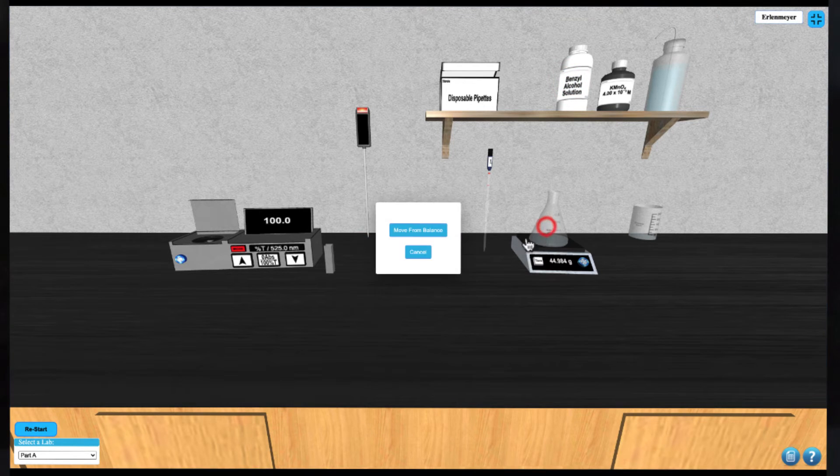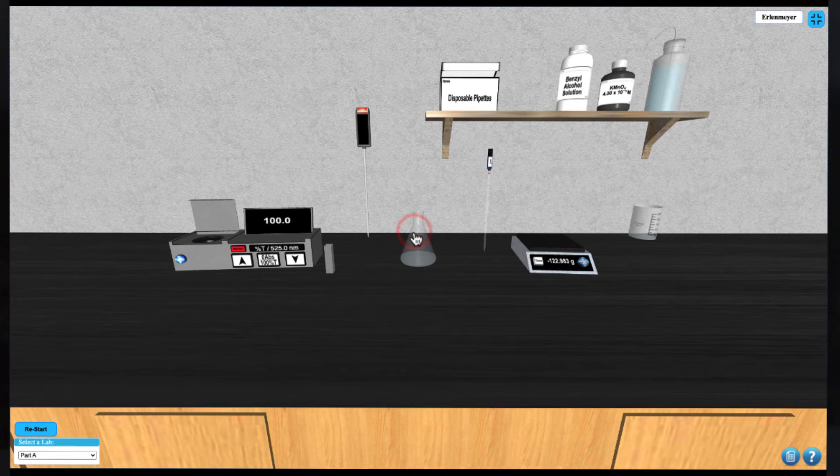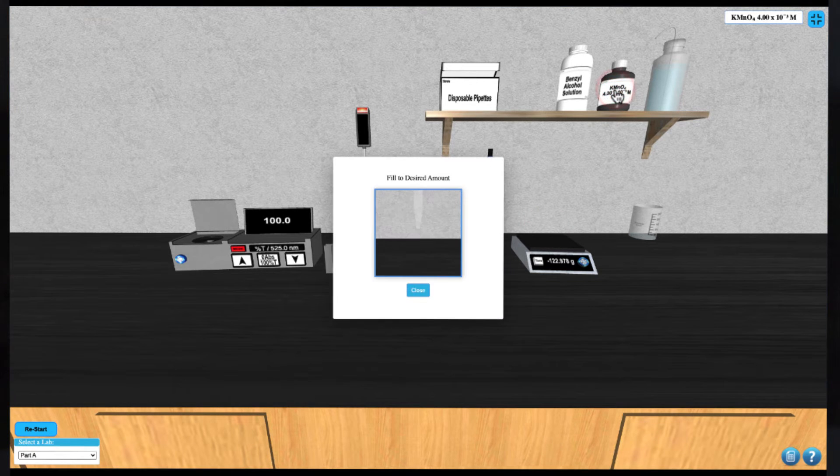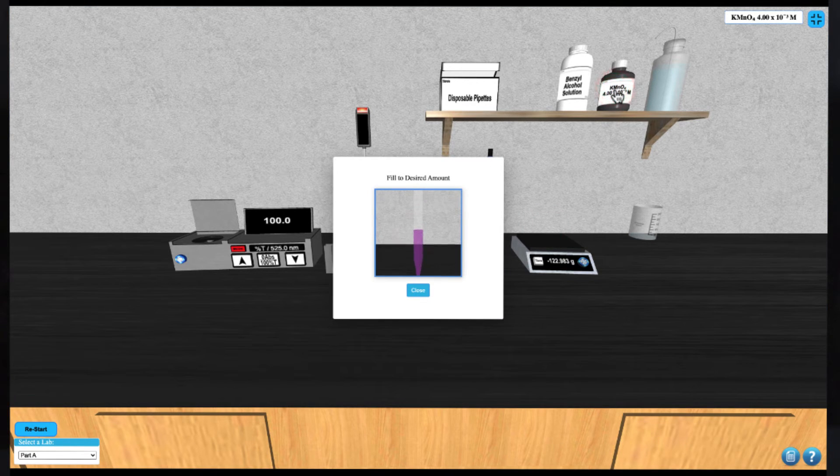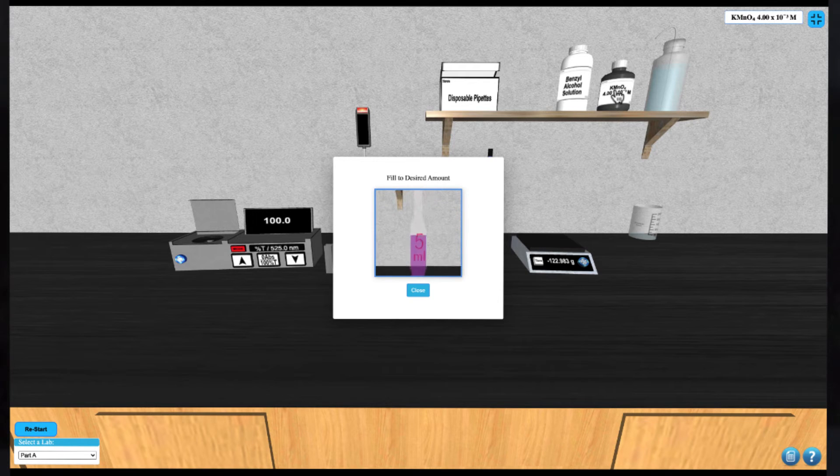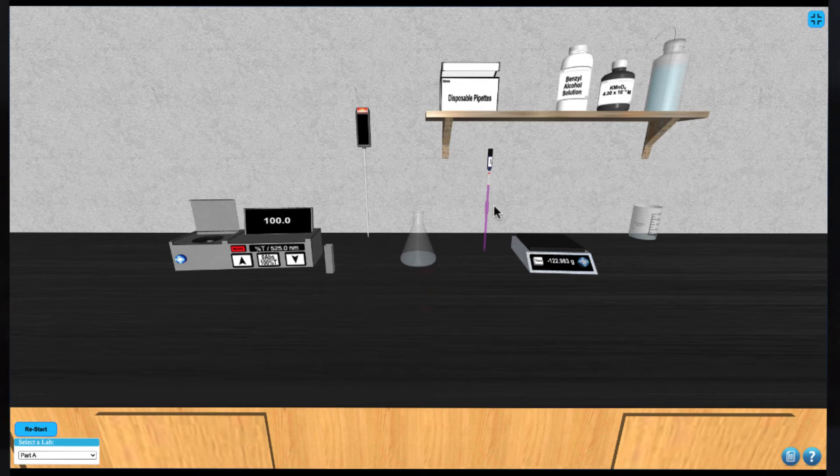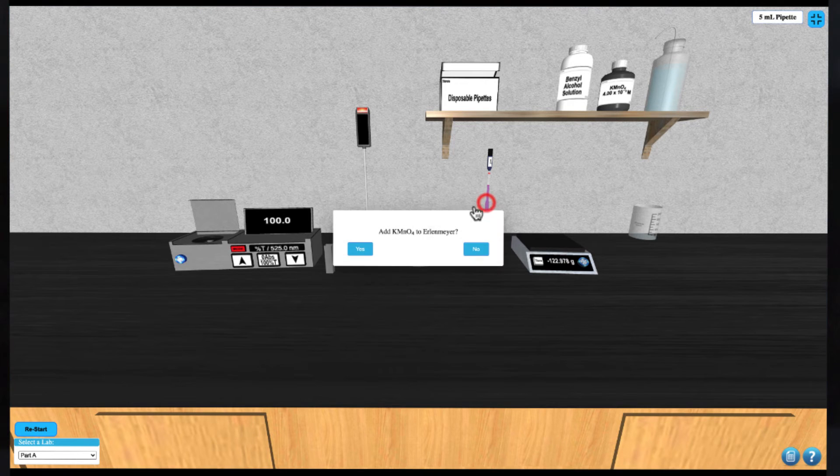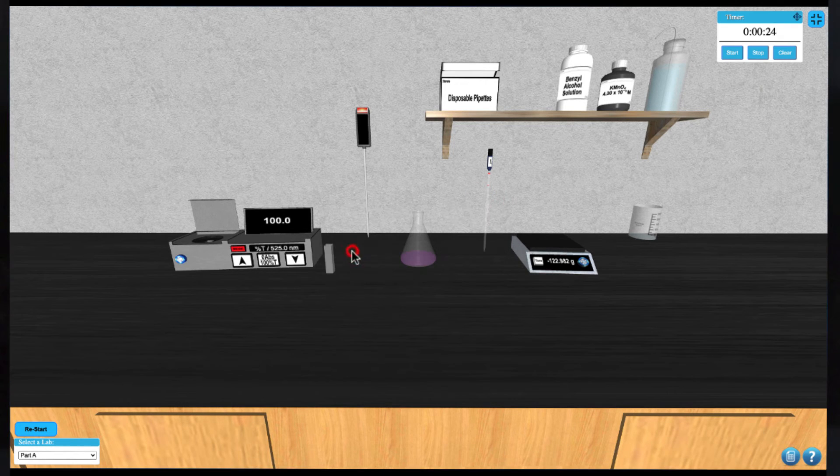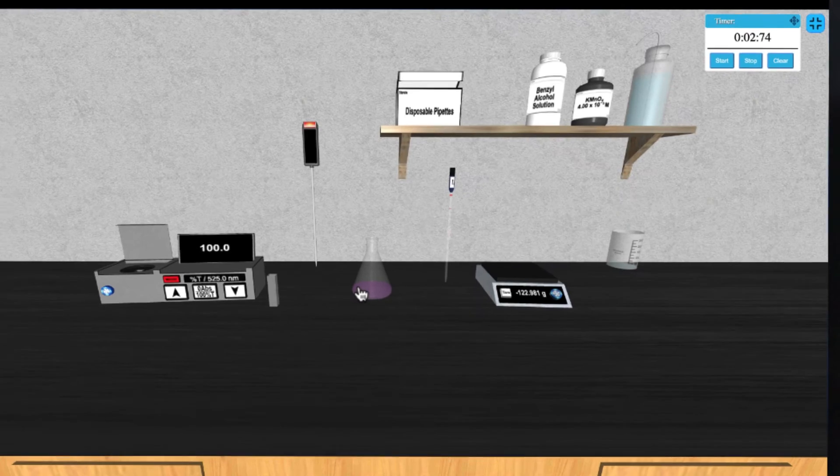Now you can click the Erlenmeyer to remove it from the balance and add the potassium permanganate. Click the potassium permanganate bottle and use your up arrow to fill the pipette. Then click the pipette to add the solution to the Erlenmeyer flask. A reaction will start along with a timer for reference.